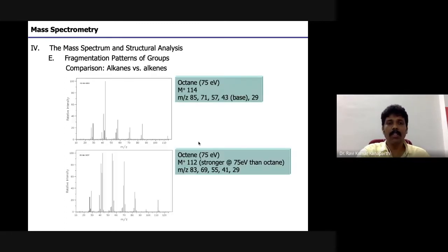Okay, so in the previous two examples, try to chalk out the plan and write different fragmentation patterns, and then see whether you can explain what fragment exactly corresponds to the 42. Work it out and then post your answer in the WhatsApp group. Let me see who will explain both the examples correctly.